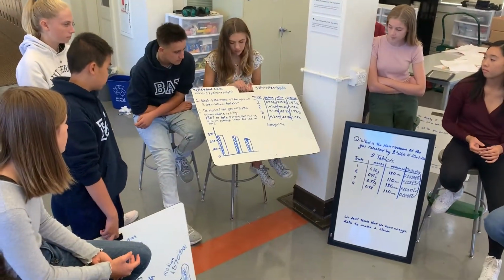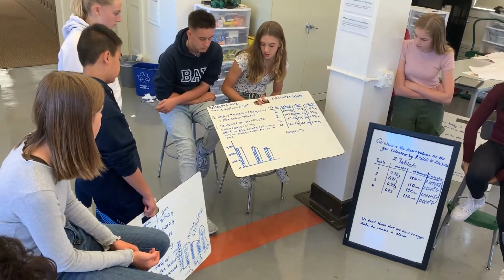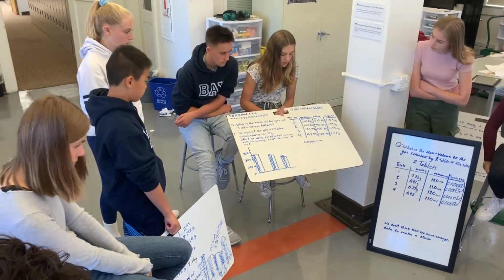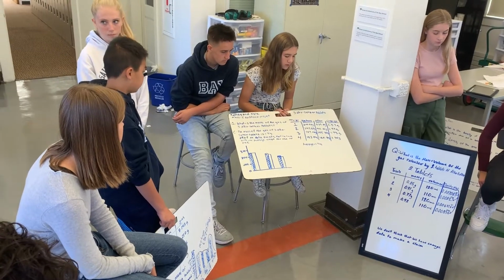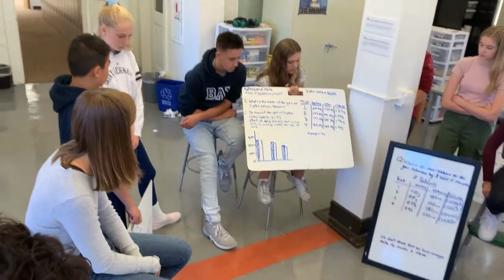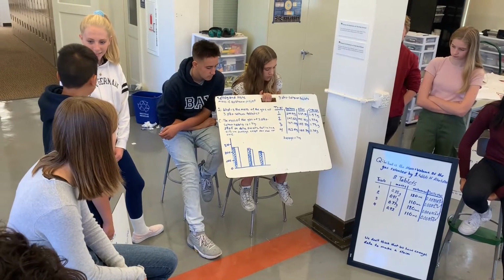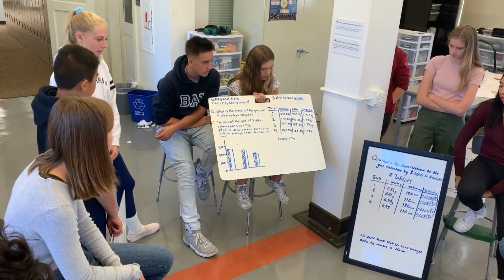We had 3 Alka-Seltzer tablets, so our question was, what is the mass of the gas of 3 Alka-Seltzer tablets? We found our average to be 1.71 grams. All of our data points fell into that range of the average, except for our first one, which was 1.57 grams.